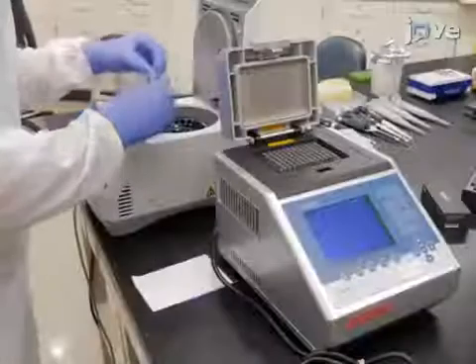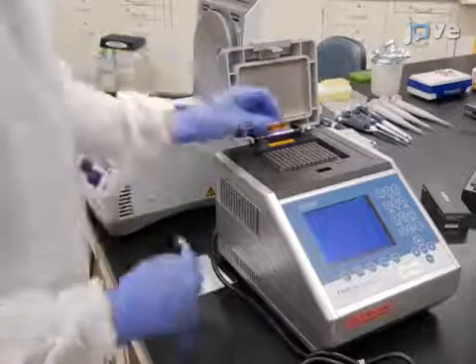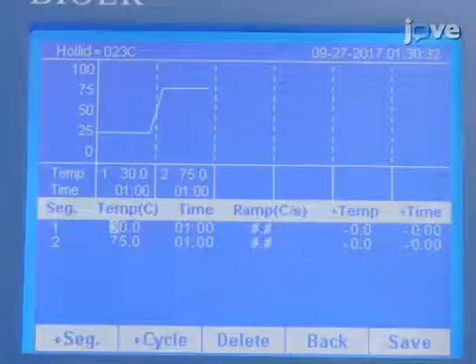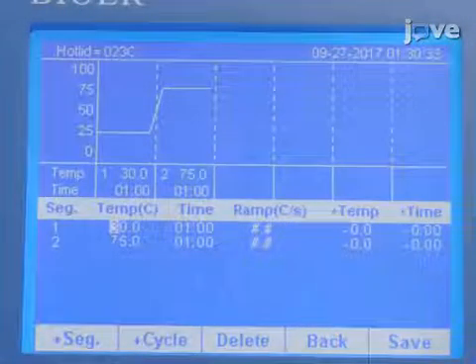Now, transfer the tube to a thermocycler for a 1-minute cycle at 30 degrees Celsius, followed by a second 1-minute cycle at 75 degrees Celsius.